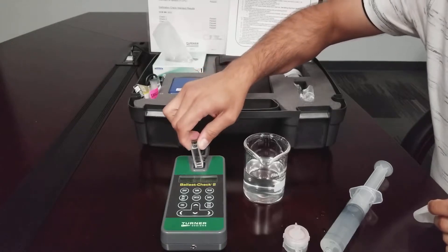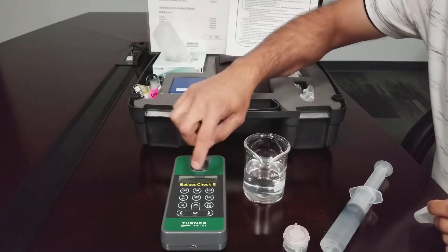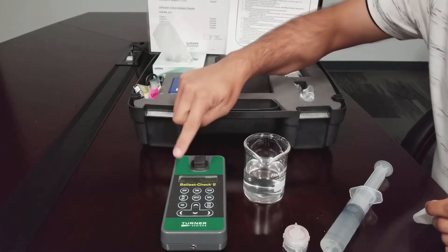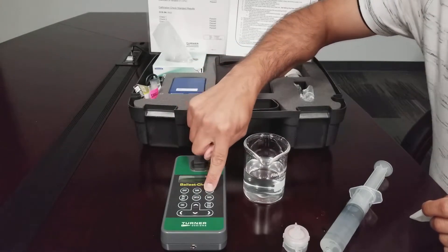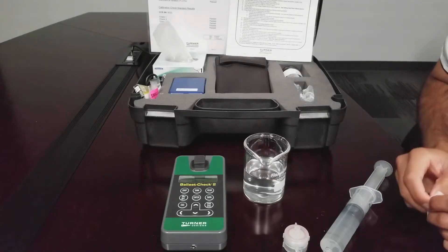Insert the cuvette into the sample compartment, close the lid, and press read. Press enter to continue with the current ship and tank values. Then press read and wait for the measurement to complete.